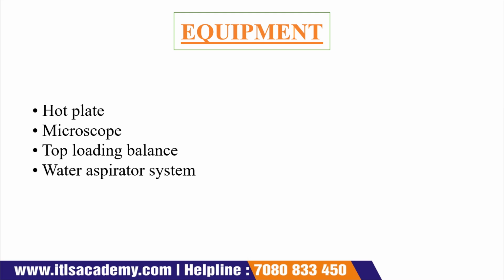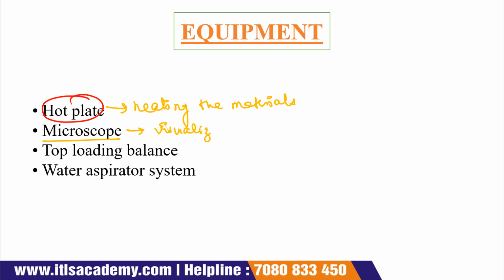The equipment required for performing this experiment, the first one is your hot plate. Okay, so the requirement of the hot plate is for heating the materials. Okay, a microscope is required for visualization of extraneous material.